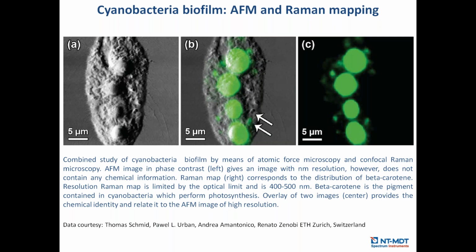And about the AFM probes which we have produced in the last few years and which we use for AFM-based TERS mapping, such tips have a guaranteed lifetime of about 1 month. And of course, in the first few weeks we have an enhancement of maybe 100 up to 200, and by the end of this month maybe twice smaller.